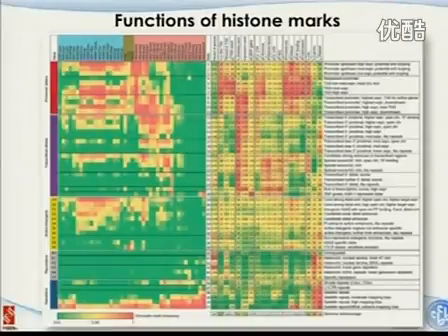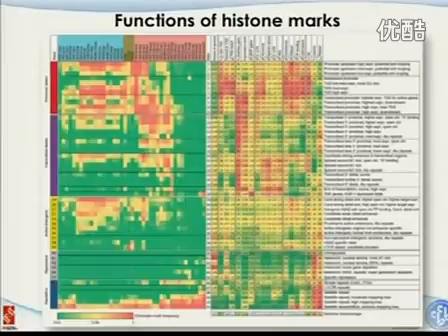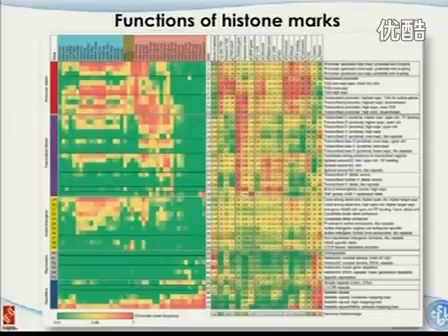If you do not understand the methodology, you cannot see the results. But I want to confirm, do you know what we are trying to do here for this one? So the first approach is, for one histone marker, we did ChIP-seq, we identify enriched regions, and that one slide is showing that, right?